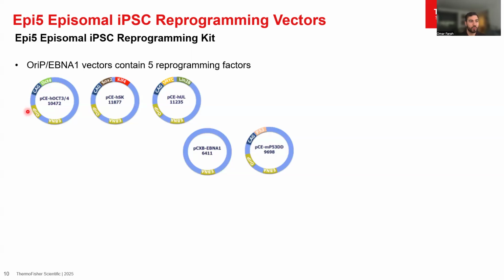You'll notice that, at least in our Sendai kit, we call that step a spinfection, where we do the transduction while we're spinning the cells as well to get them to kind of pellet down a little bit more. But there are certain techniques that can be employed here, and we can talk about this a little bit more later on, and I'm happy to go over this one-on-one with you, Tyler, to give you more specific recommendations too. Great, thanks. Of course.